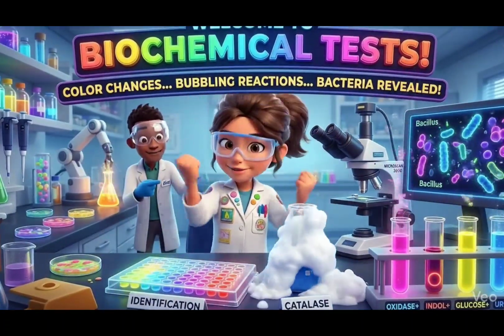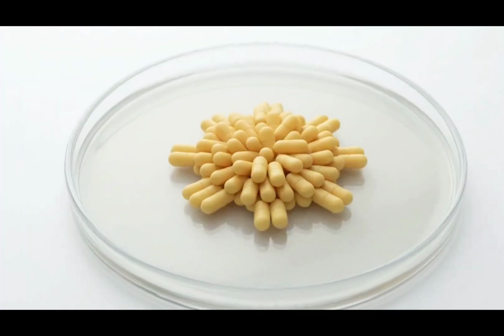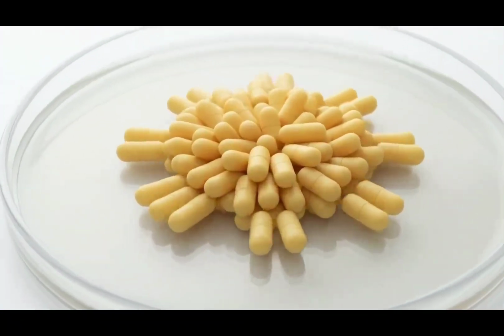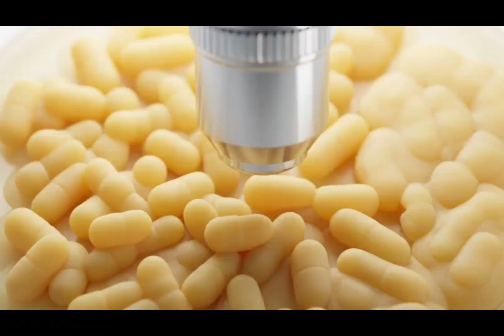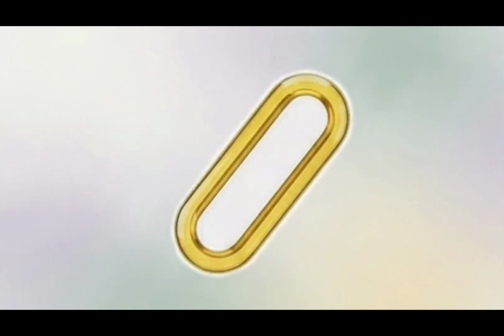Welcome to Biochemical Tests. Looking through a microscope will only get you so far. You can observe the shape and the stain of a bacterial sample, but when you are staring at an ambiguous colony like this, visual observation hits a wall. To figure out exactly what organism is growing on the dish, we have to map its internal chemistry.